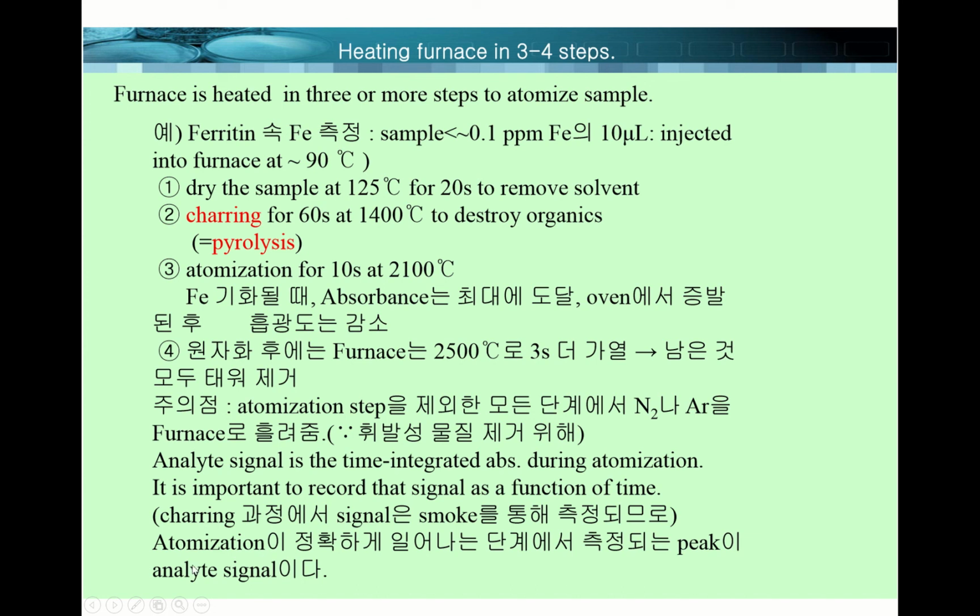So the analytical signal is the peak signal at the step of atomization.